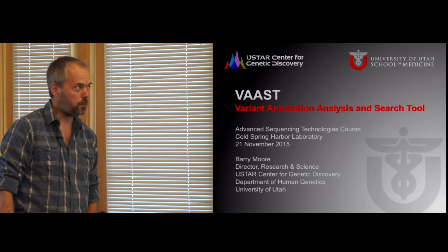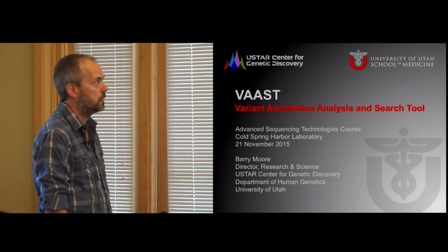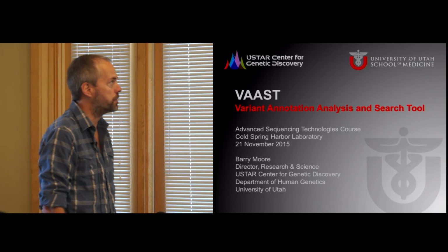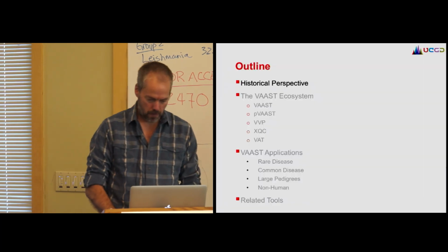So I'm going to talk to you today about a tool. I work primarily with Mark Yandell's group there in Utah, and I'm going to tell you about a project and a tool, really a framework called VAAST, which stands for Variant Annotation, Analysis, and Search Tool.